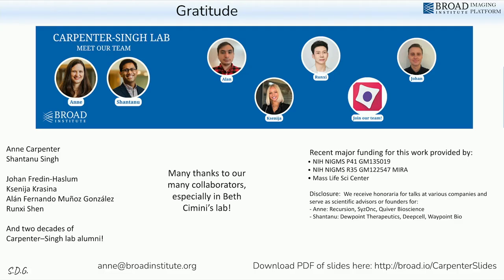And I think it's possible, but the problem is generalization. You can definitely do that for a given dataset, like within one company that collects images consistently. But something that works for any lab, any of us that just produces bright field images, it's not there yet.